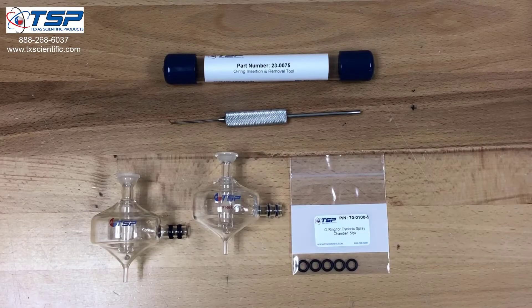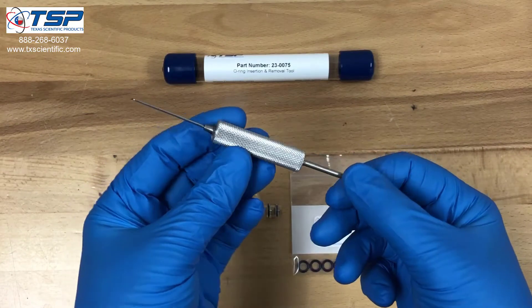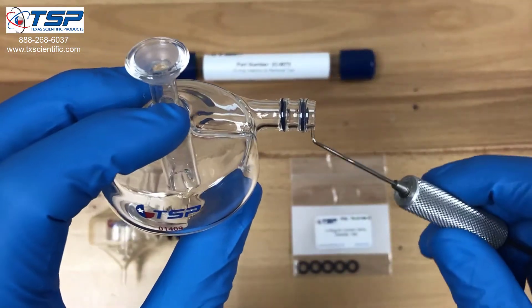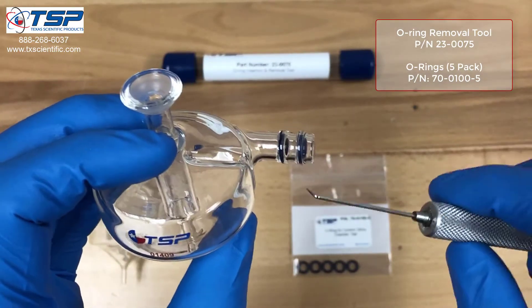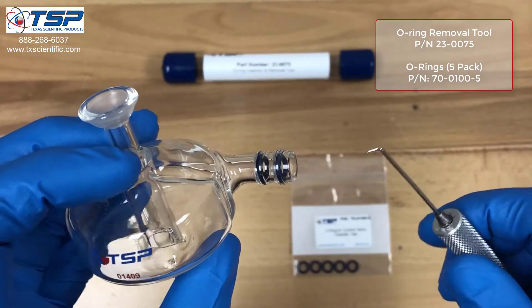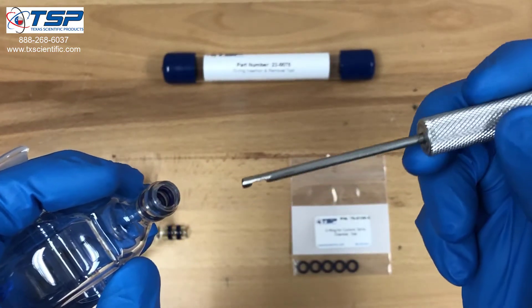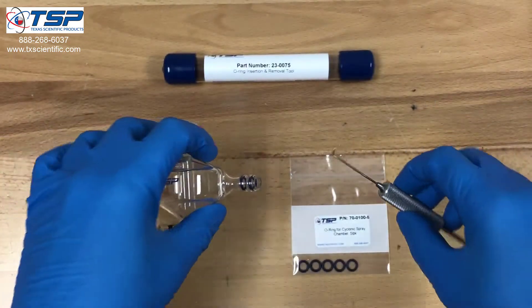In this video we're going to take a look at our o-ring insertion and removal tool, and we'll use it to insert and remove some o-rings from these spray chambers. You'll notice here that we've got an o-ring here and an o-ring here. The nebulizer fits into this opening, and the o-rings are used to form a seal around the nebulizer so there's no air leaks. Periodically these o-rings need to be removed and replaced. This tool has two ends: one end has a notch in it and the other end has a hook in it.